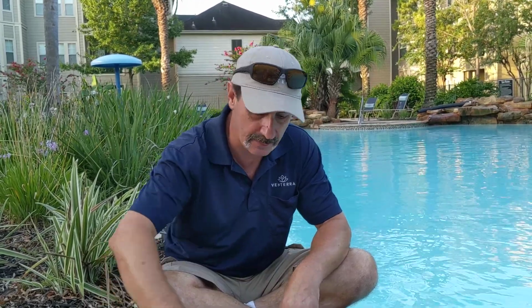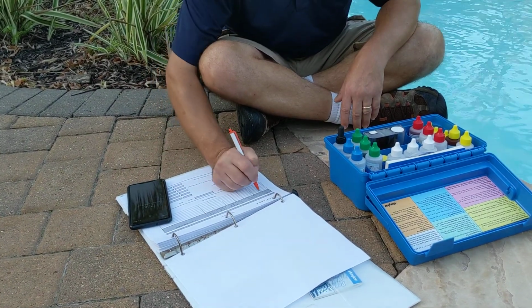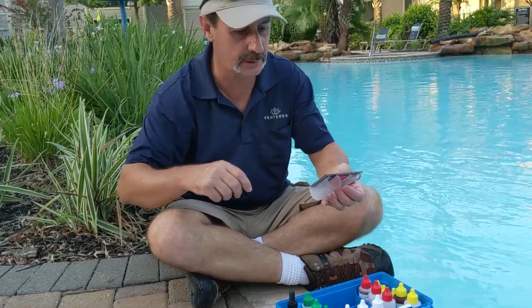We need to test it every day, of course. Make sure that you keep your notes in your log. So, we're going to look at the chlorine this morning.